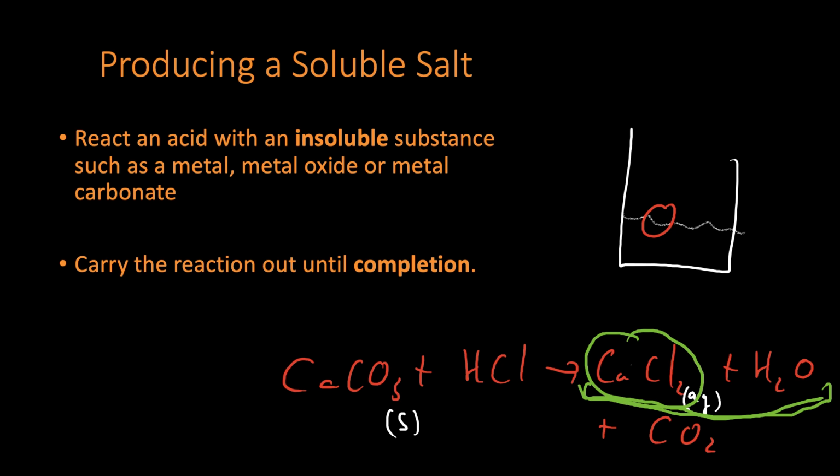That gets rid of your acid. Once it's in excess, you then filter off the solid. Then you know for a fact you have a solution containing your soluble salt. Then you heat it until crystals form. Once crystals form, then you transfer it to an evaporation basin and then you leave it overnight or leave it for as long a period as you like in order for crystals to form. Generally, the longer you leave it, the bigger the crystals, and so that's really down to you.